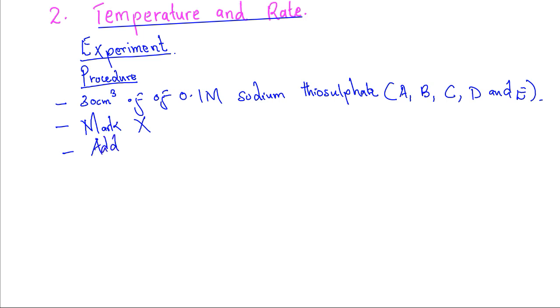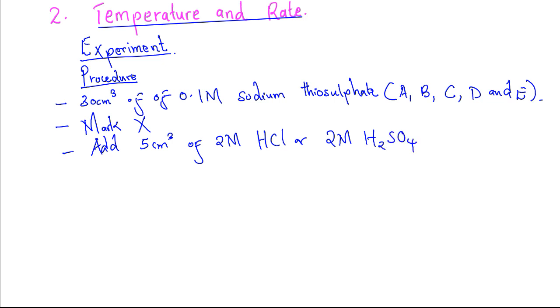Add 5 cubic centimeters of 2 molar hydrochloric acid, or you can use 2 molar sulfuric acid. And at the same time start a stopwatch.